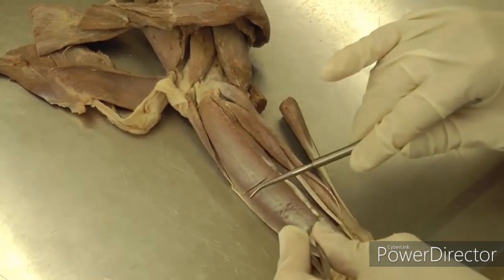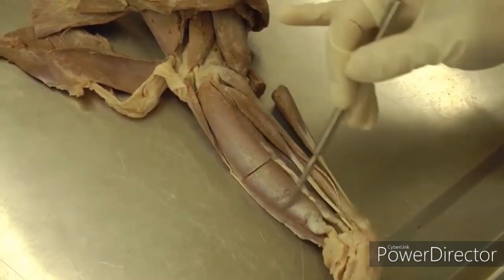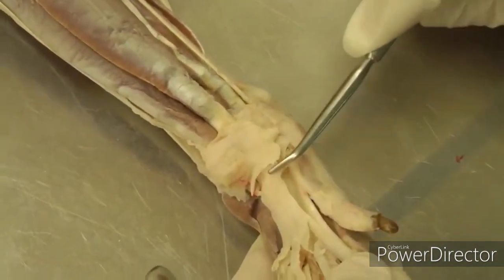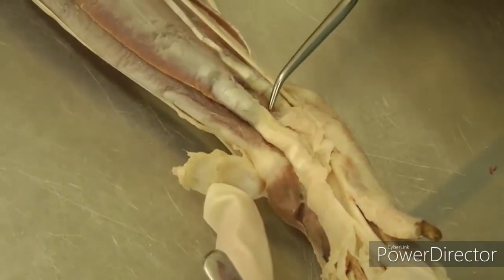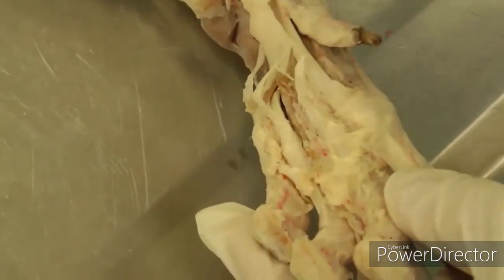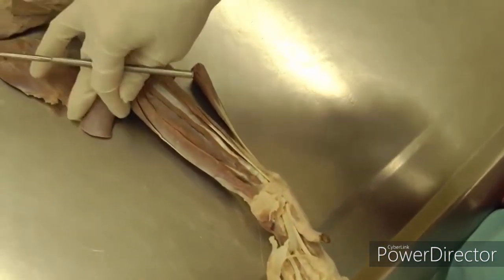The next one you'll run into is the superficial digital flexor, which is actually kind of flat if you pick it up and isolate the side of it. When you follow the tendon for that, you're going to run into that flexor retinaculum we mentioned earlier. Just peel up that first layer of flexor retinaculum and pull it away so you can isolate the tendon of superficial digital flexor and follow it down to the toes, extending to all those digits. Then reflect that up and out of the way.